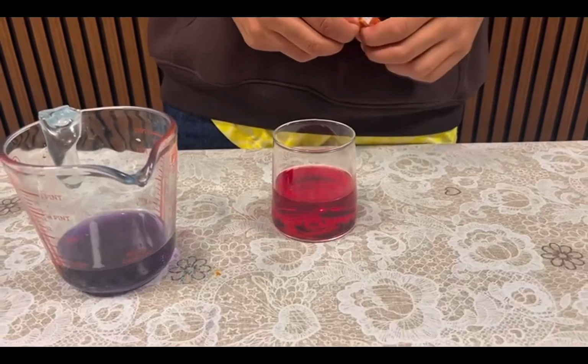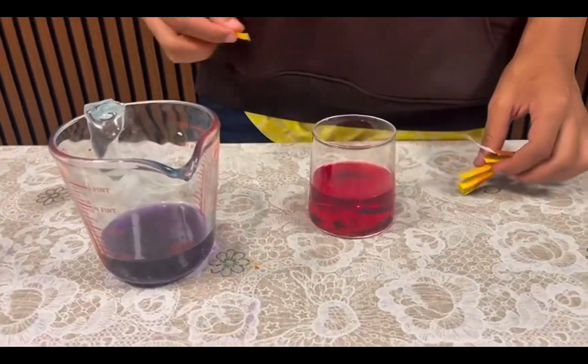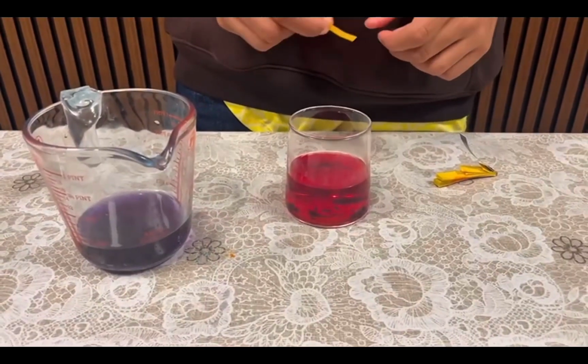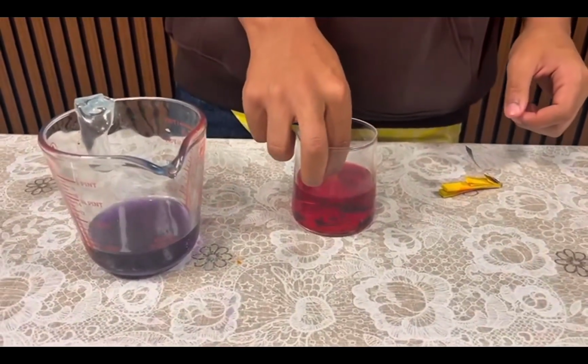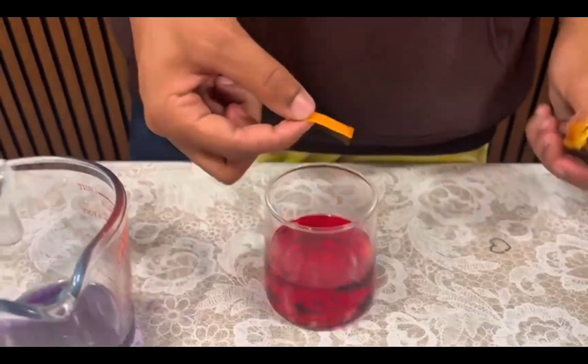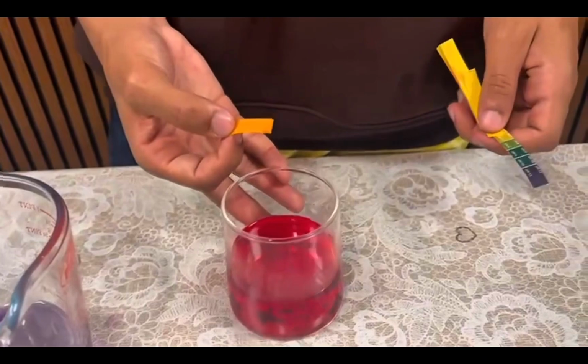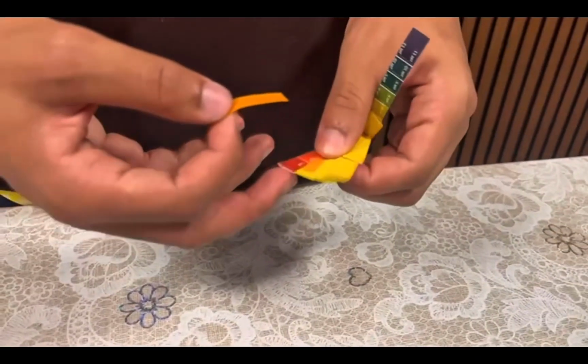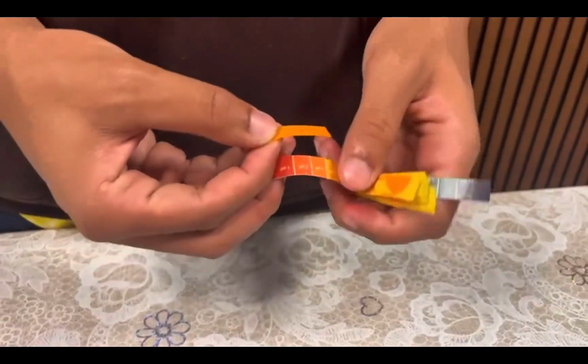Vinegar, it's also acidic. Let's double check the pH just to make sure. Don't want to make any guesses. Okay, let's see. Yeah, it is orange. The pH is most likely to be about 3 to 4. Let's make sure.